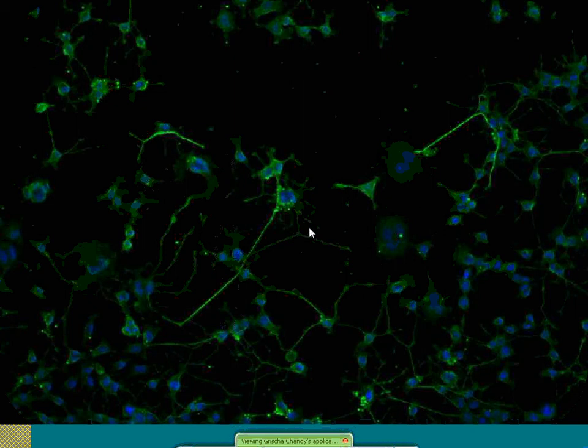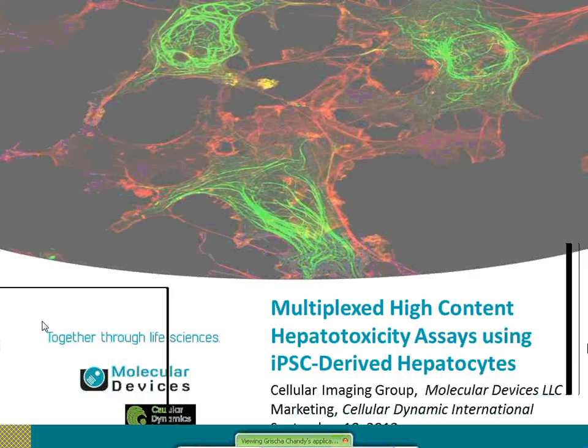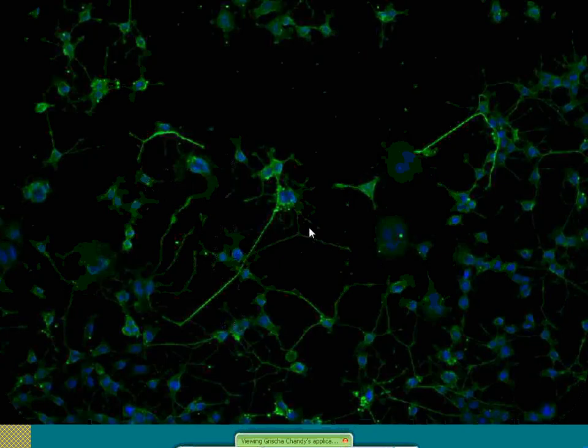And that's why it's really important to be able to manufacture these cells at very high purity, so that you can take those very pure populations of cells, mix them together in certain ratios in different formats, which could include different 3D formats, 2D formats, in a very precise and measurable way.